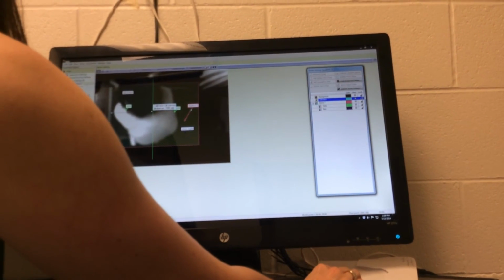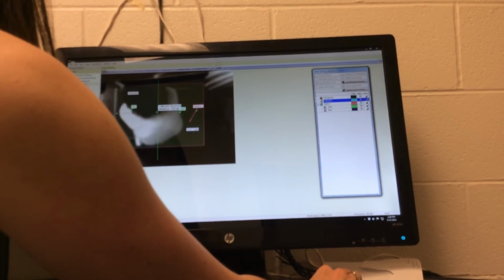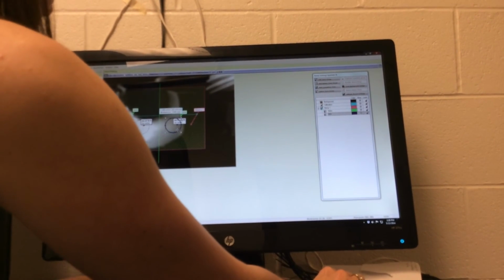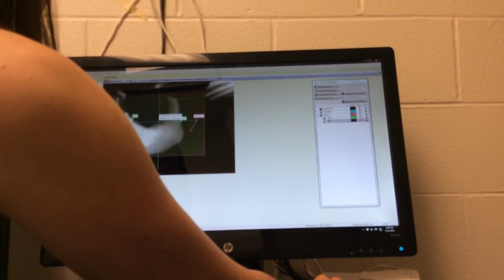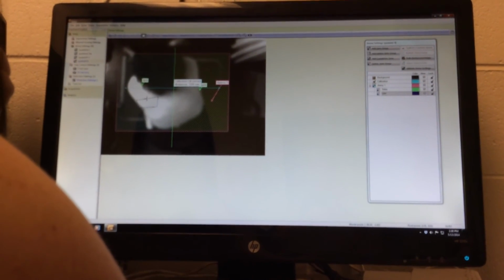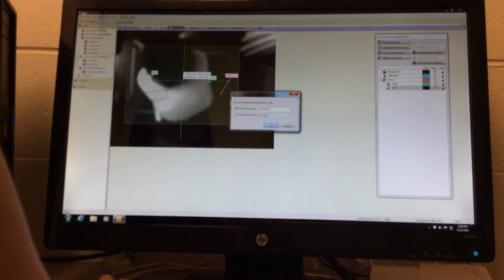And then you can also draw, we'll go back up to here. So let's do it this way. Actually, I'll do this one. We'll change some of this. So I'm going to rename this one as tube. So that'll be our new zone. I'm going to delete these. Okay, so now I'm going to do just a free form drawing, and let's say that there's a tube here. Okay, and I'm going to call it restraint tube.